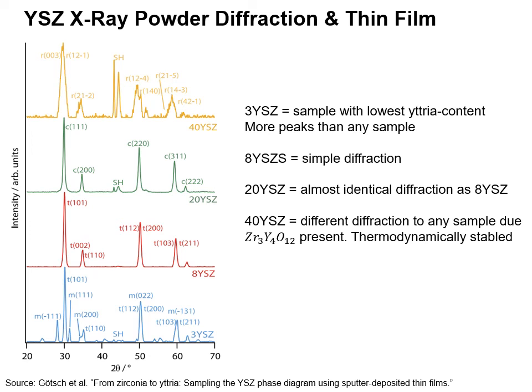And I wanted to quickly go over what the presentation was about. I wanted to tell you what X-ray diffraction is, the principle, its pros and cons, and explain to you what thermal coating is, pick one of those commercially available thermal coatings, and do a quick X-ray diffraction analysis study for it. That's about it for my presentation.